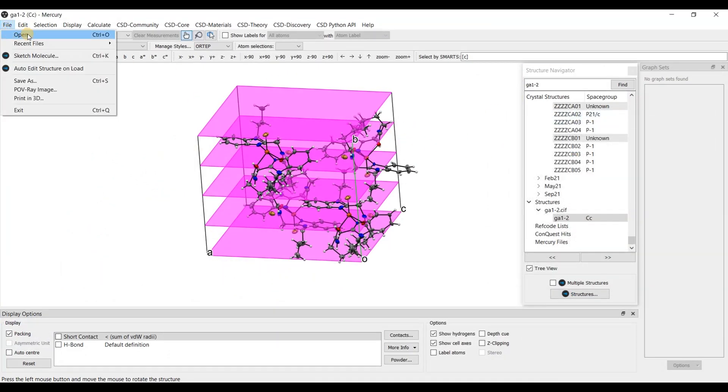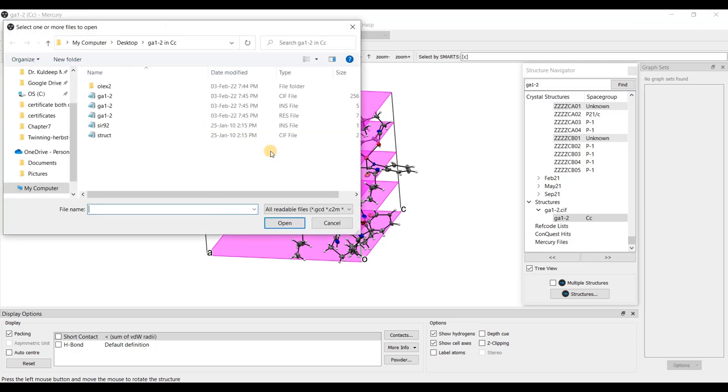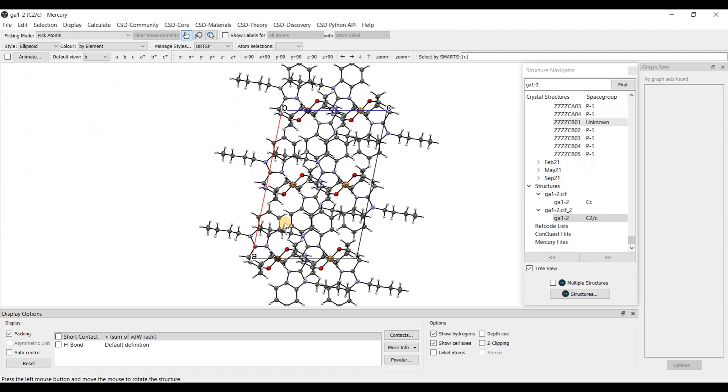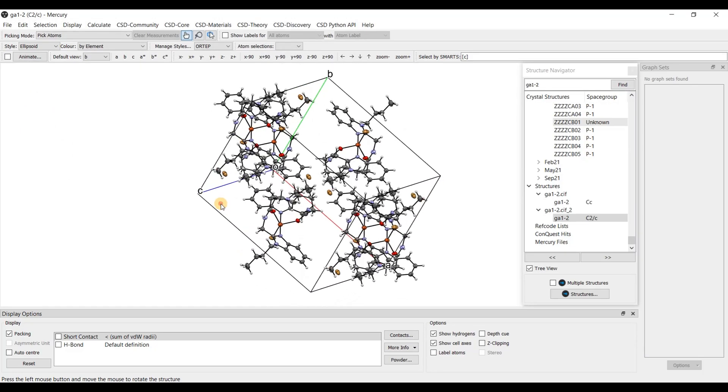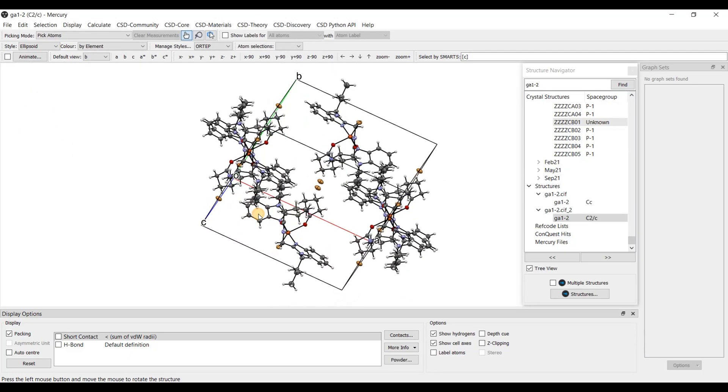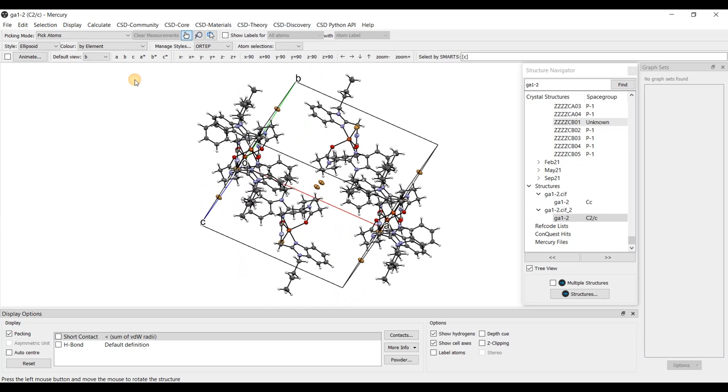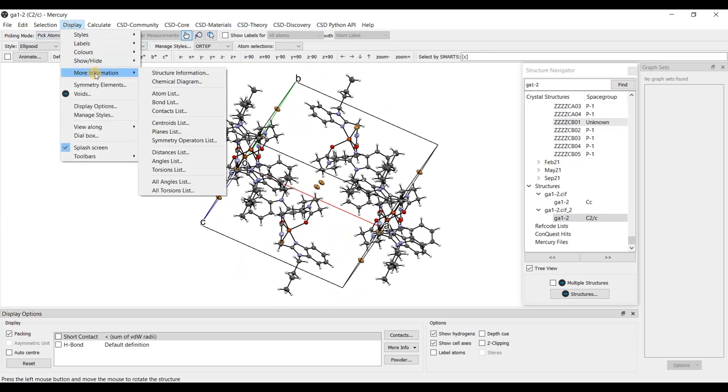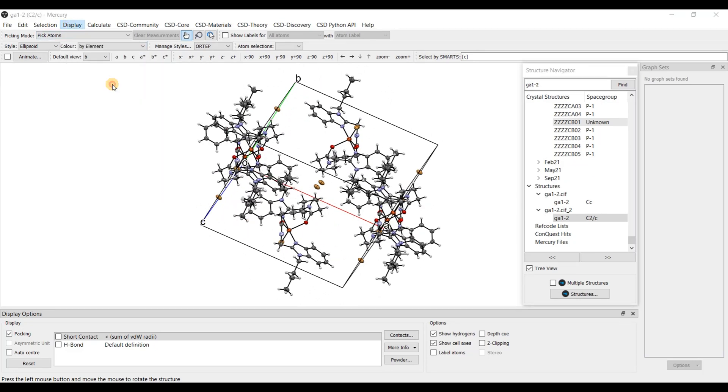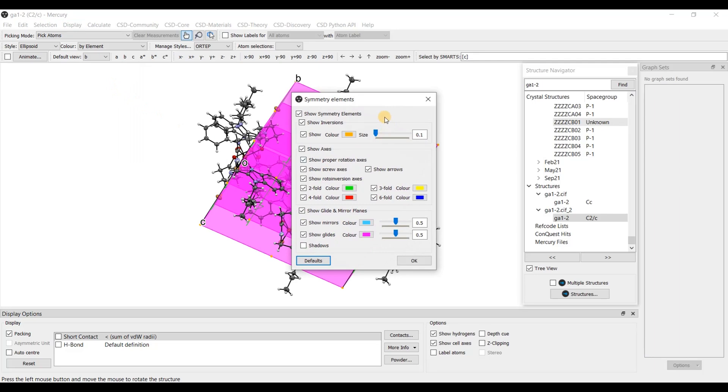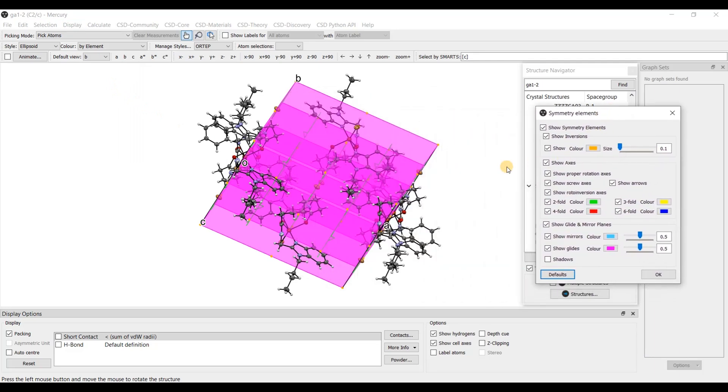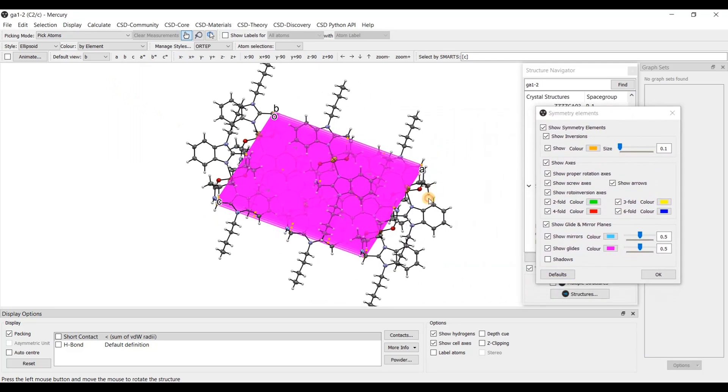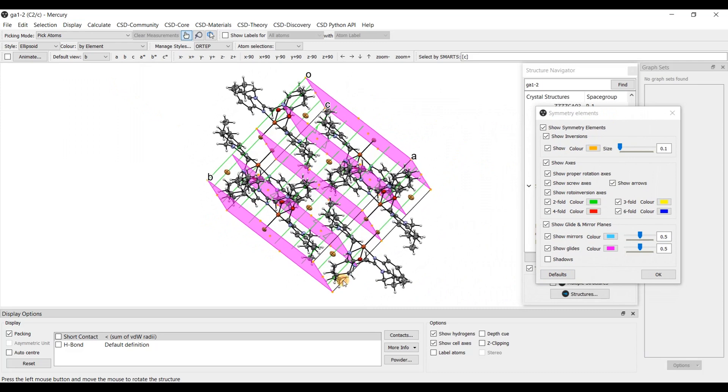File open. And now I open this CIF file. Okay. Now this is the unit cell in space group C2/c. Display, go to symmetry elements. Now I have the symmetry element, glide plane c.